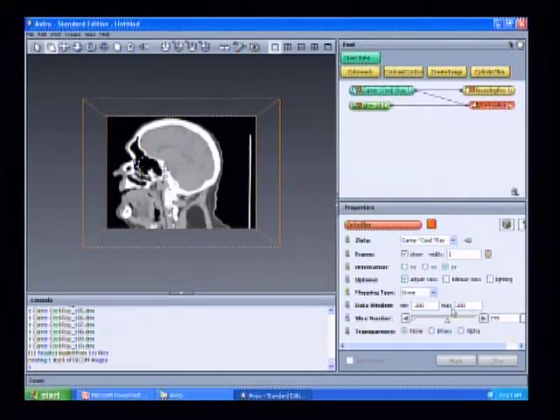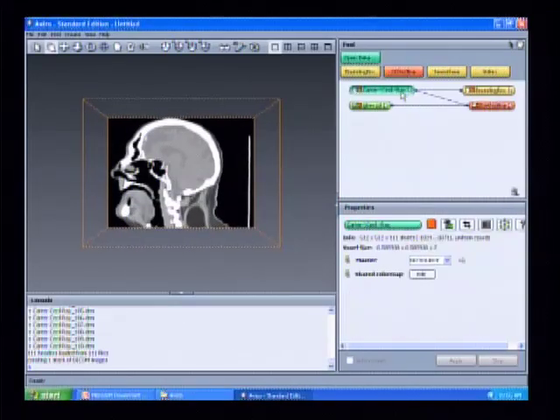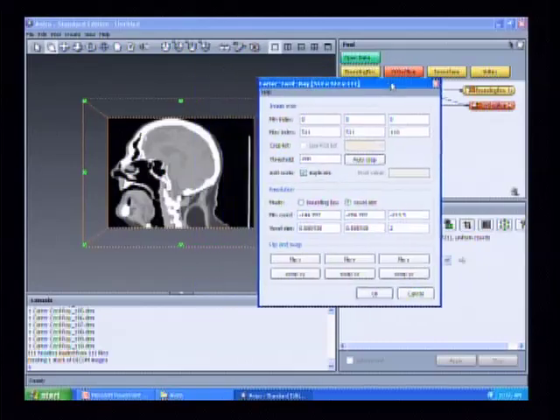Then once you decide what those were, you could go back up to your data set here. Once you click on these data sets in this pool area, they go into a shadow mode so that you know what you've selected. But you can click on this crop tool, same image that's in most programs. Then you can put in a number.